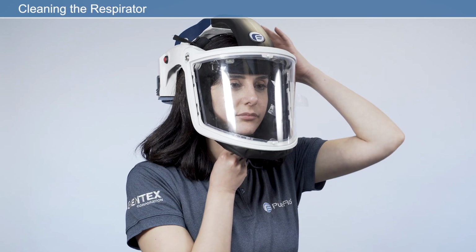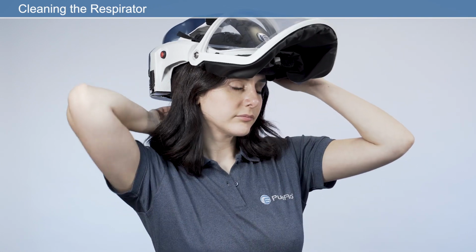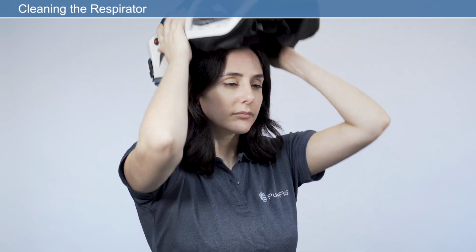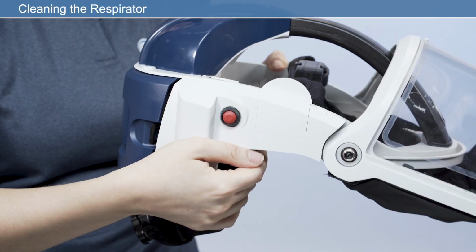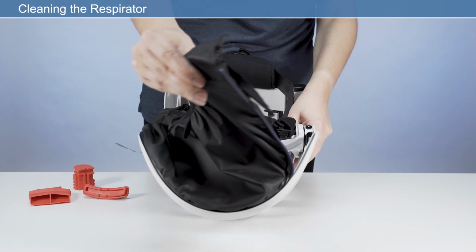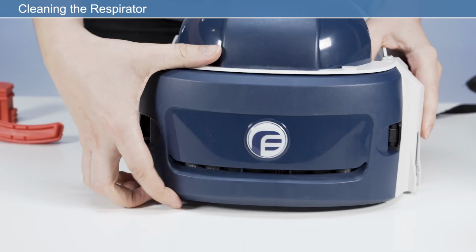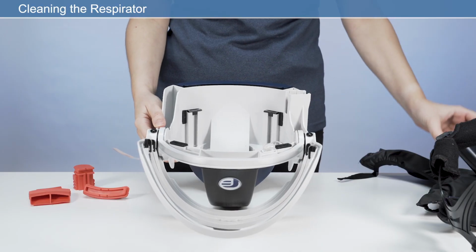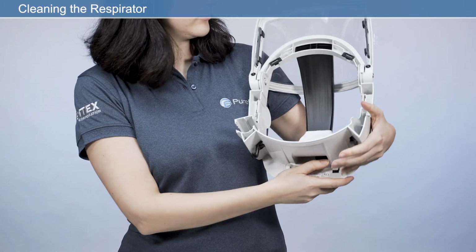The respirator should be cleaned after every use. Remove the respirator from the user's head before cleaning. Warning: never use pressurized air on any part of the respirator. Before cleaning, remove the headband assembly, HEPA filter with cover, along with the rechargeable battery. Insert the provided cleaning plugs as shown for the air outlet, air inlet, and battery cavity.